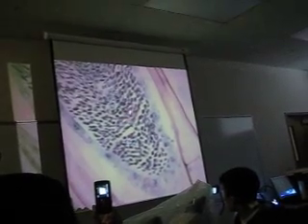Then we have the male moss, which is number eight. These are the antheridia — stained various colors. A segmented hair is called a paraphysis. And there's the cells that will become sperm. That's 40x power.